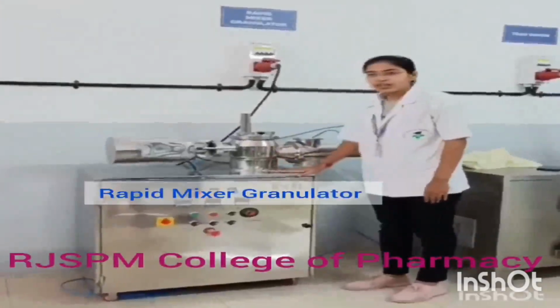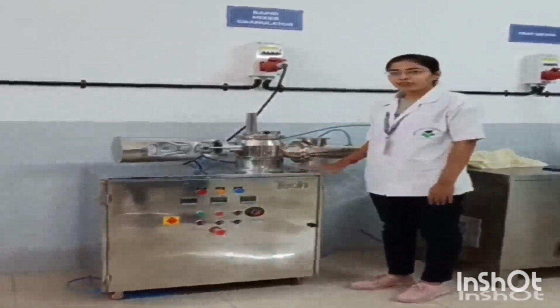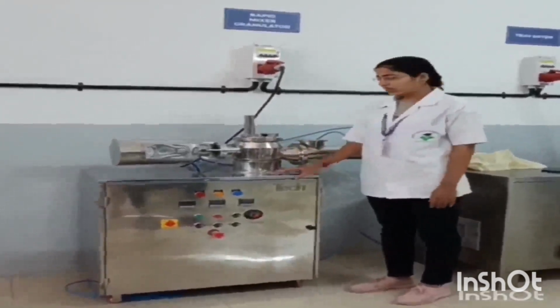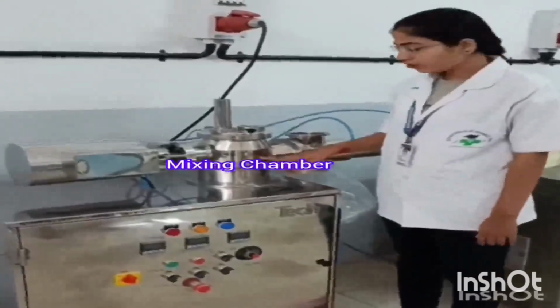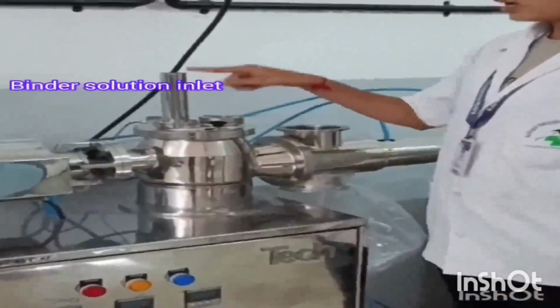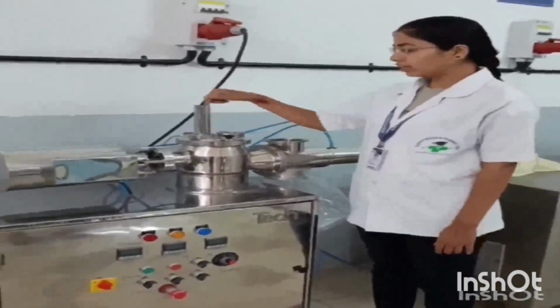Rapid mixer granulator. This machine is used for preparing granules for pharmaceutical manufacturing. It is also called a high shear granulator. There are various parts of this machine. This is the mixing chamber for mixing of all ingredients. This vertical part is the liquid binder solution inlet for pouring the binder solution in it.